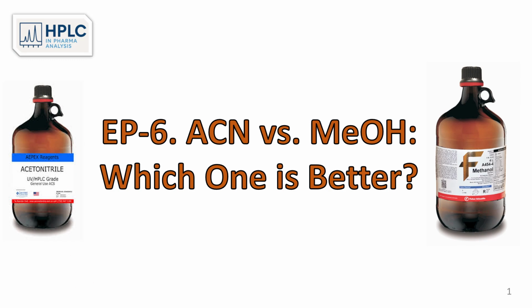Good morning. This is Michael Dong on episode number 6, acetonitrile versus methanol. Which one is a better mobile phase for reverse phase of pharmaceutical analysis?